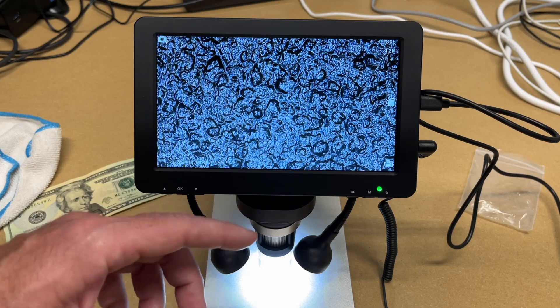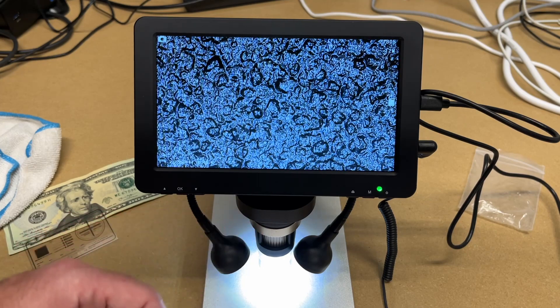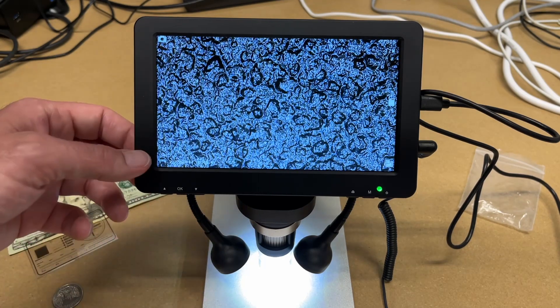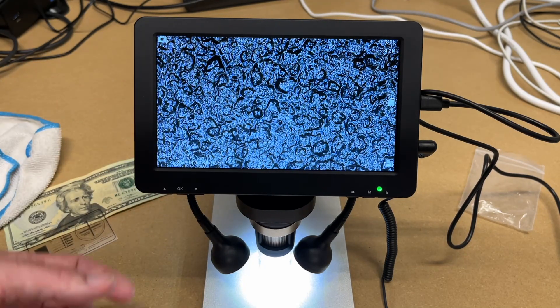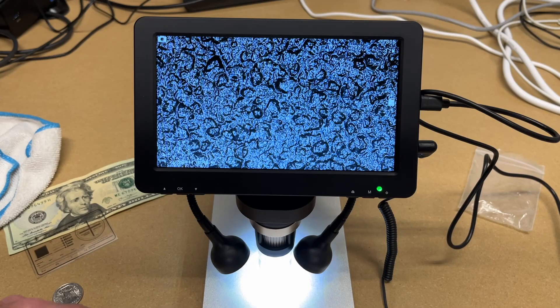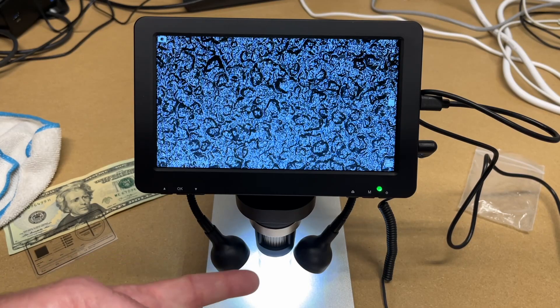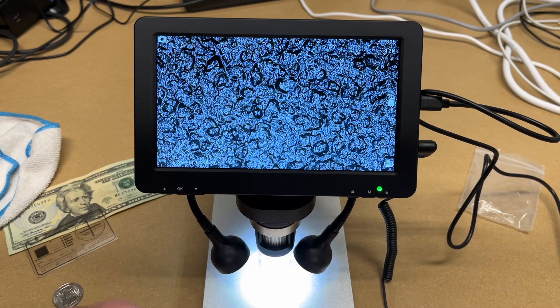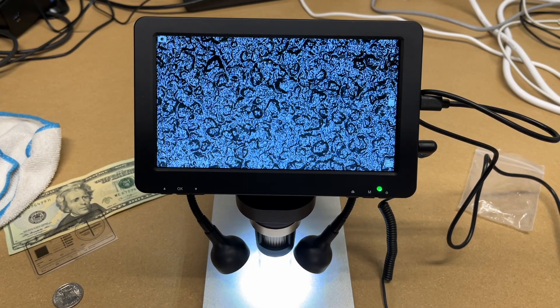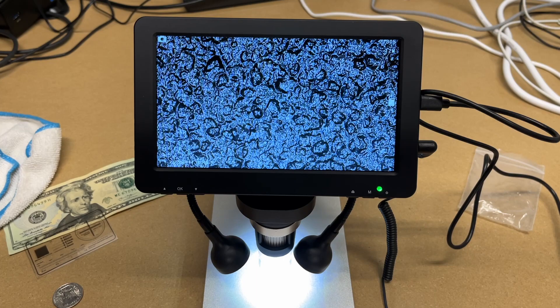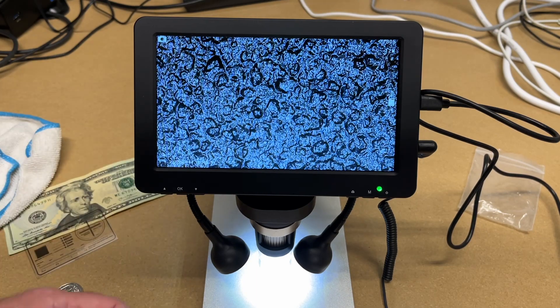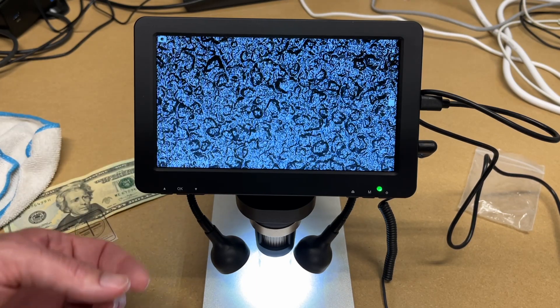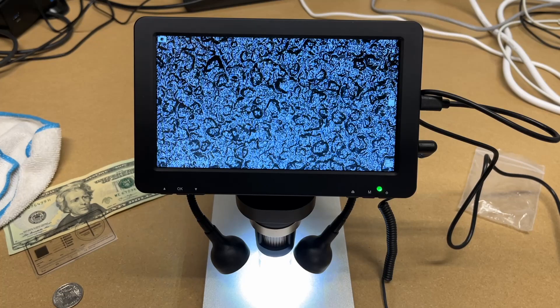So I've always thought of a microscope as being more like lab equipment or something. But with this, I can take this camping with me. I can put this in our RV. When we're at a campsite, I could pull leaves and stuff and look at them right there. Don't have to have a computer hooked up to it or anything. Or if we go on a weekend hike, I can leave this in the car, collect things on our hike, come back and look at them. Super versatile.